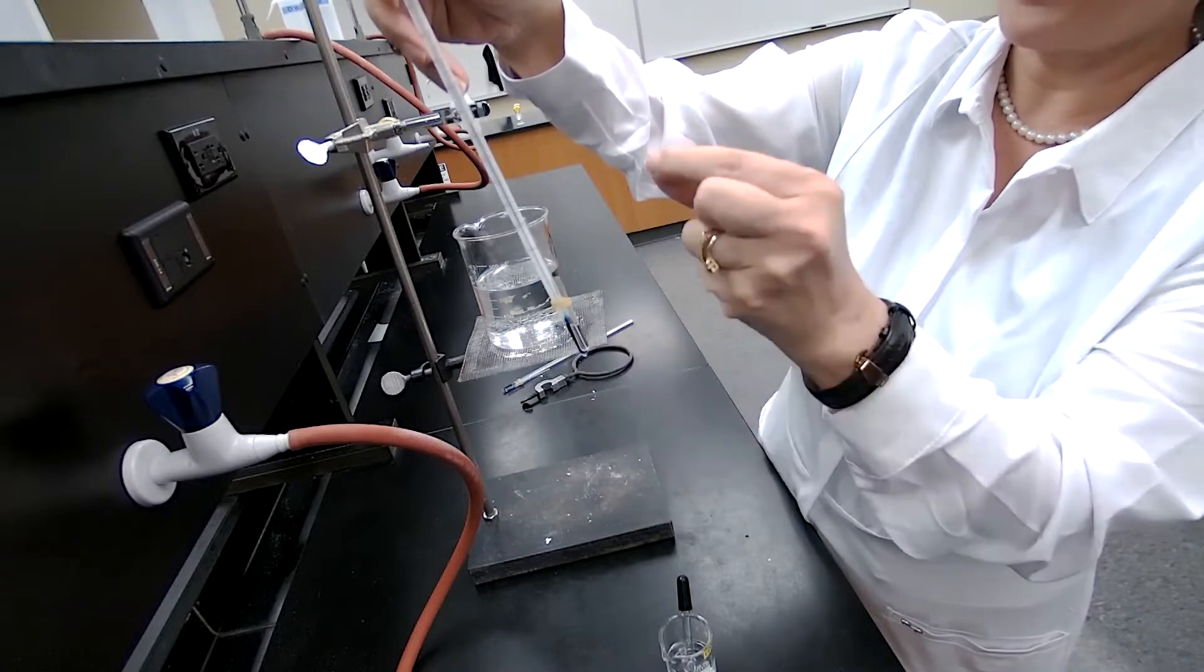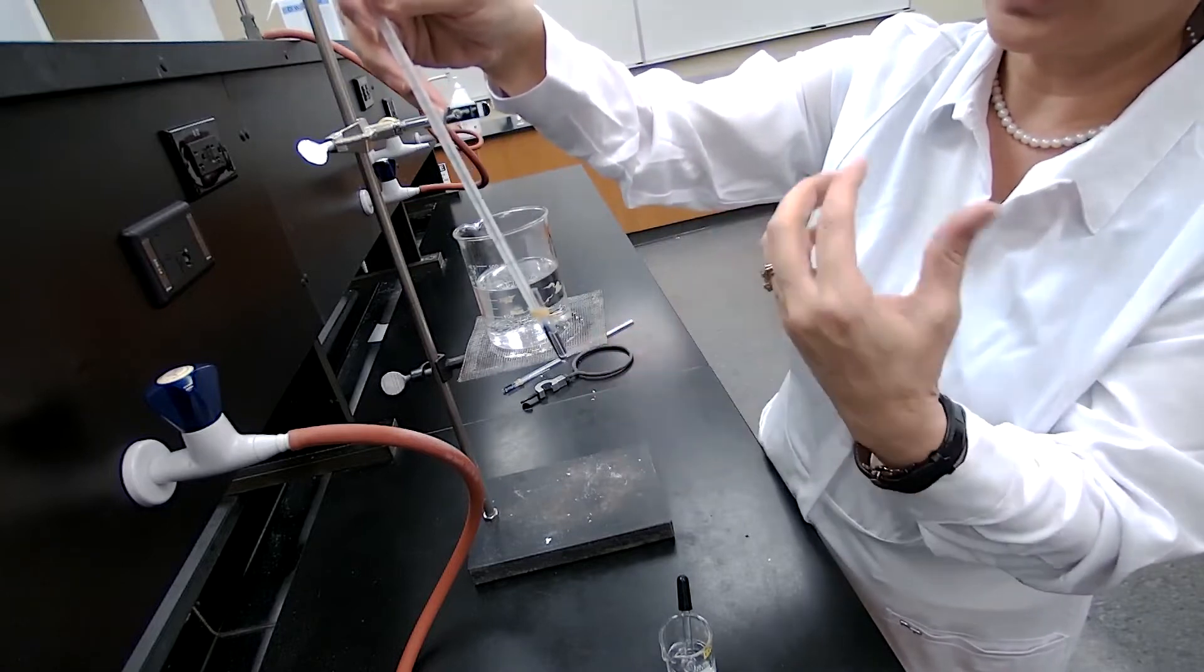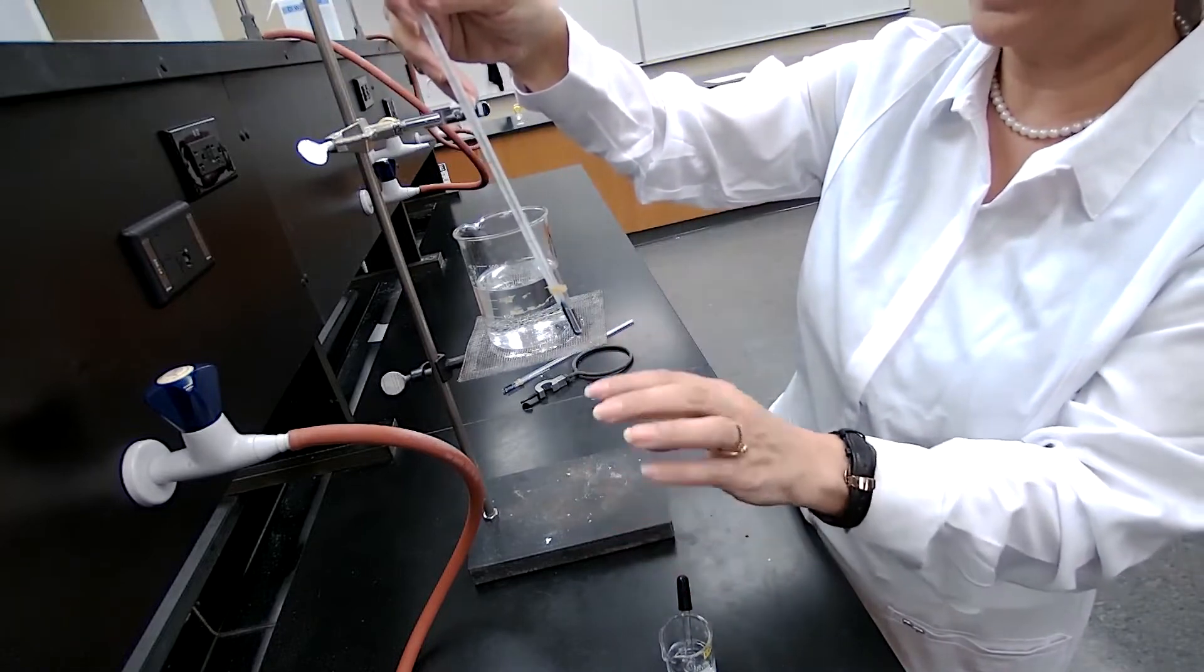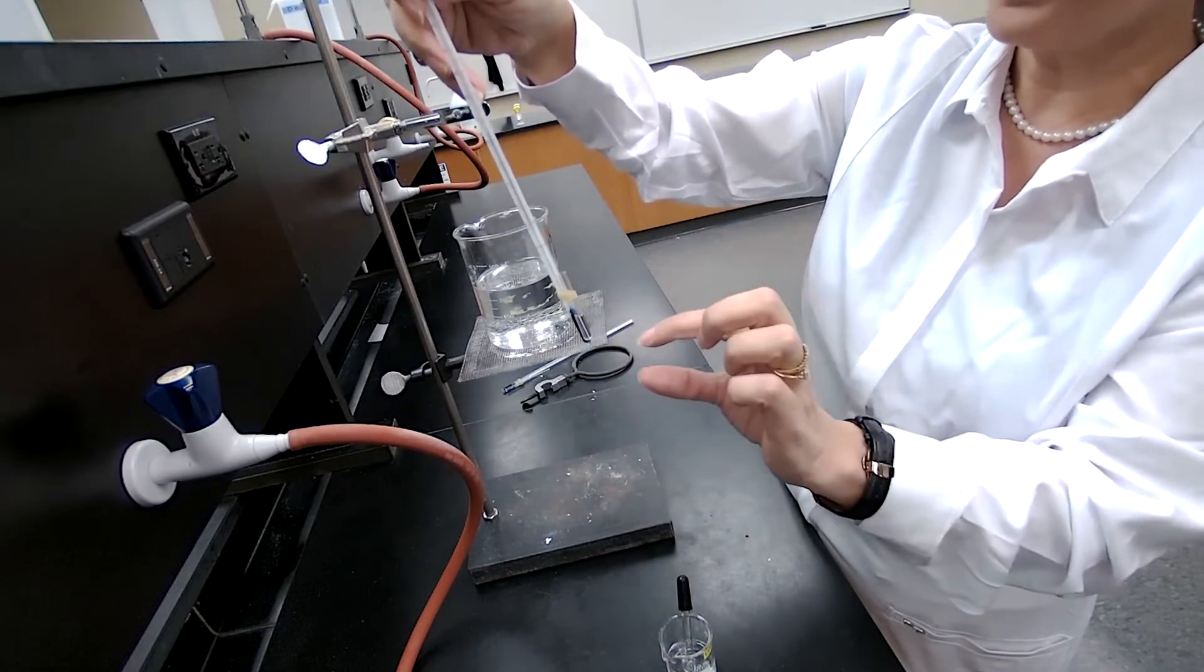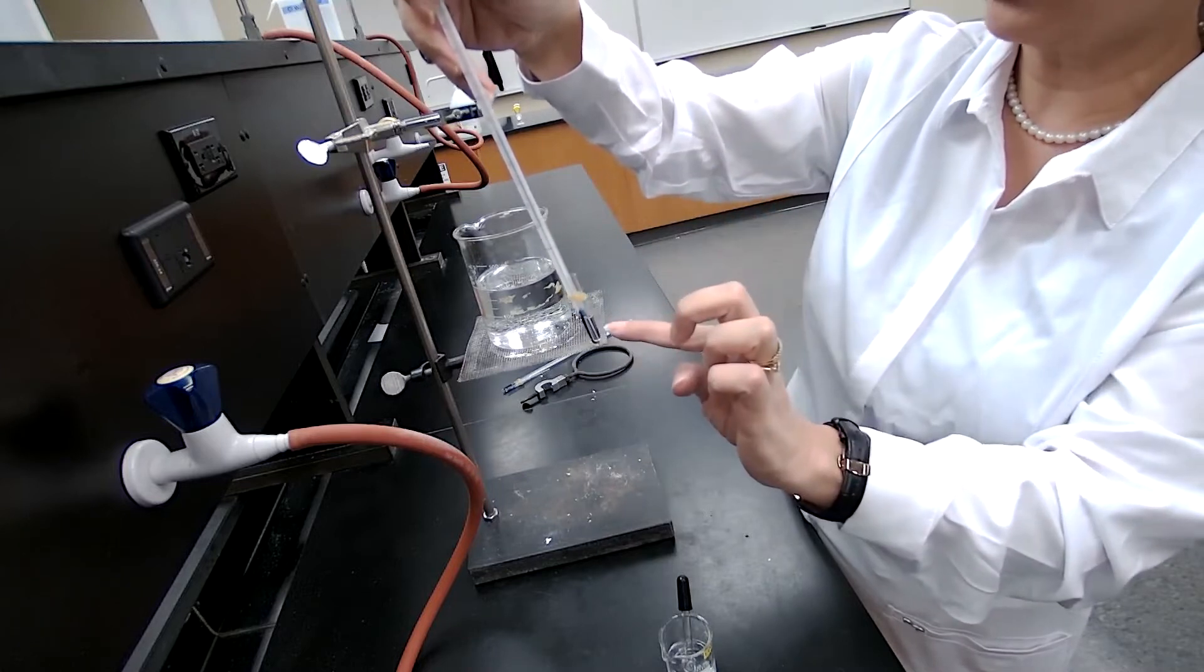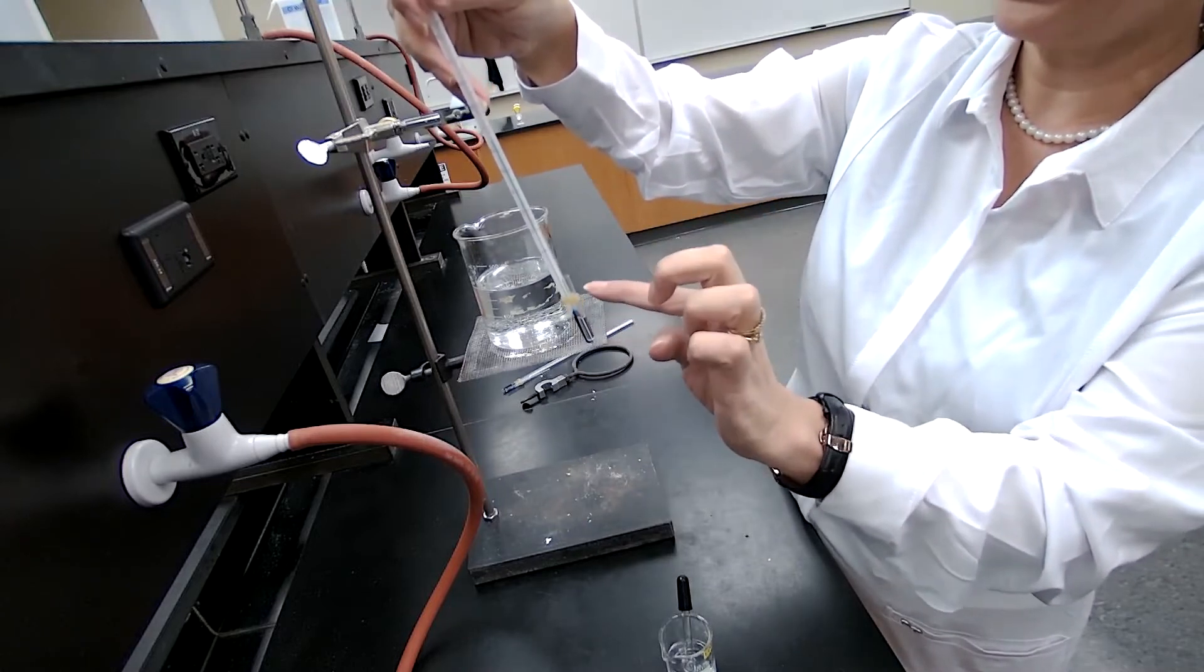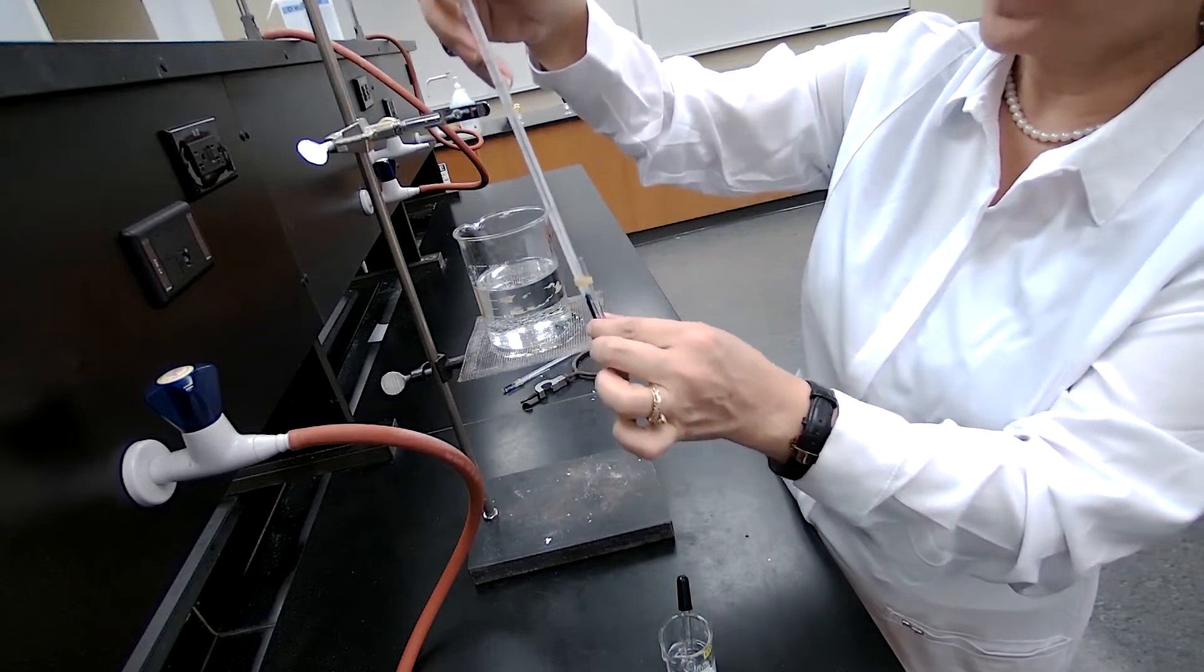When the bubbles come out very fast, that means the temperature is higher. So I would stop the flame, and I will wait for those bubbles to stop coming out. And just before the liquid goes up in the capillary tube again, I record the temperature.